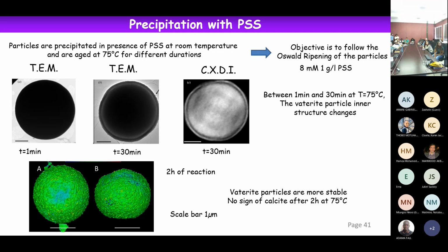And so if you really want to know what's going on, you try to understand the 3D image, coherent diffraction imaging. And here is the top view of the particles, and here it's a view on the side. And you can see that the particle is slightly shrunk in one direction, but you don't know what's going on inside so far.